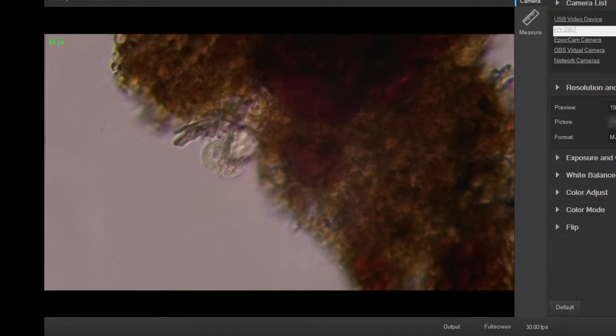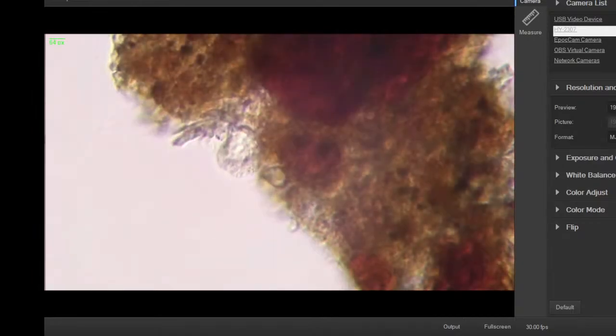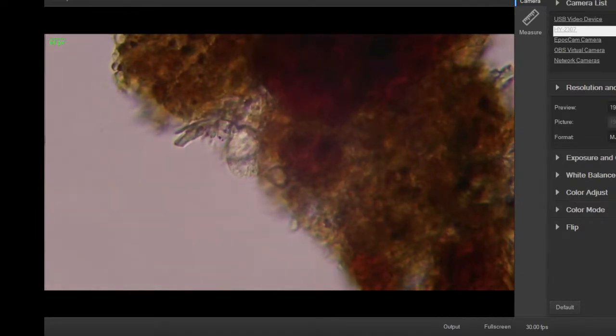This guy's just hanging out here, looking for some goodies. Let's see if I can make this pop a little bit more. It's not giving me much latitude, but at least it's focused. See what it's up to here. So 400 power. Still fairly small, 400 power. This might be around 40 microns across that cell, something like that. I need to get my little micrometer out and double check the measurements on that.